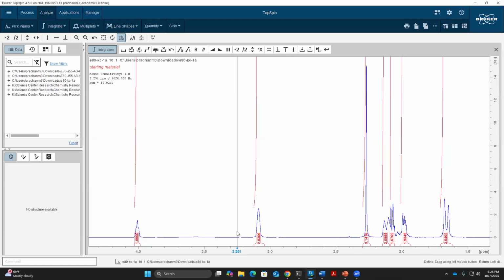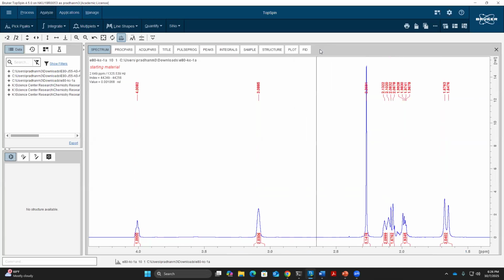Once I've done that, now I need to save all the changes that I have made. In order to save changes, I need to go to the functions bar and just one from across the right, you can see this logo, which looks like a return and save logo. I'm going to press on this logo once, and now I have saved all my changes for the integrate function.